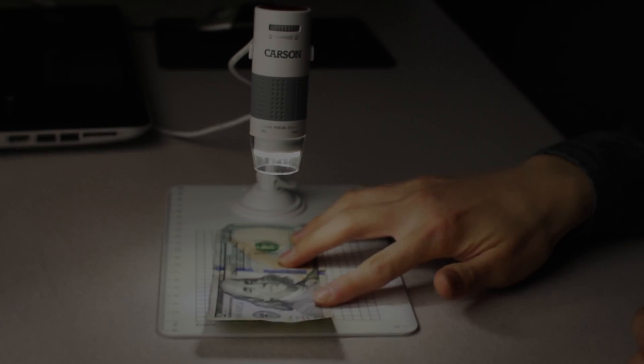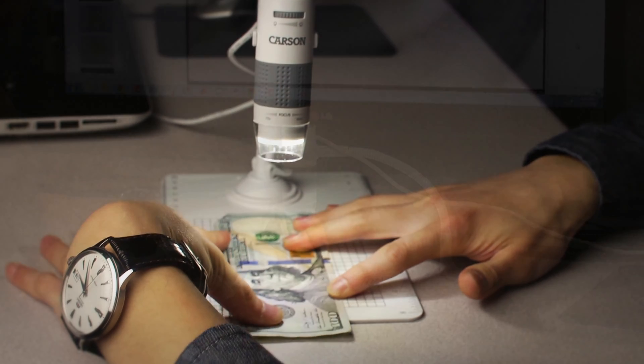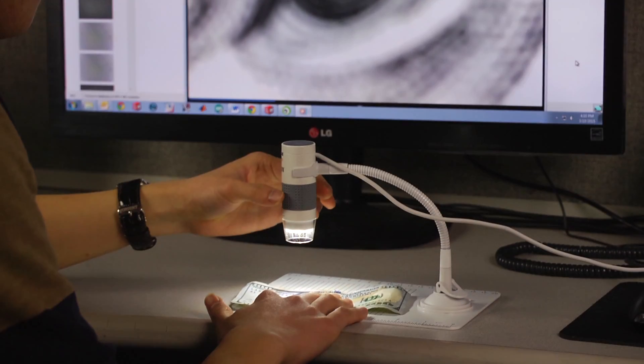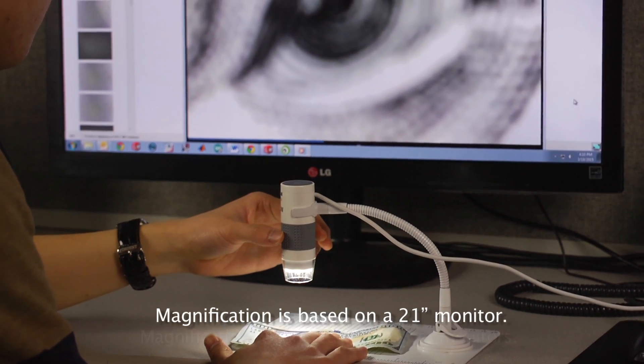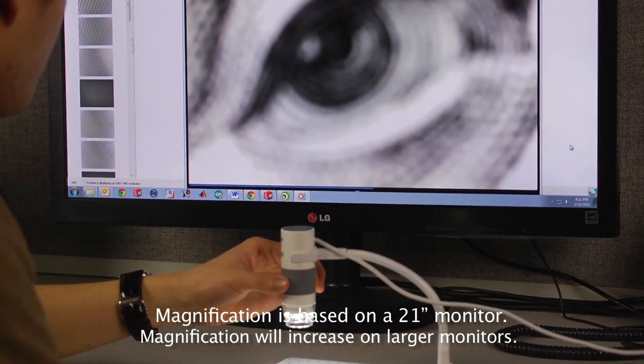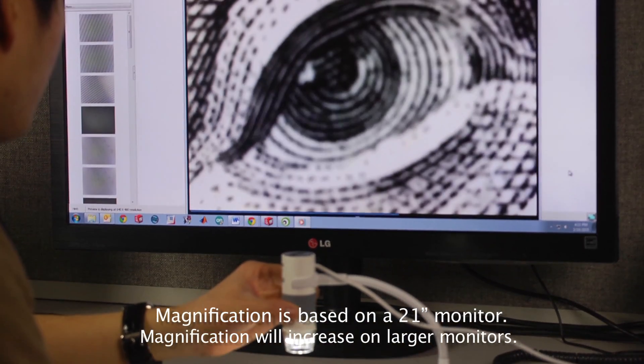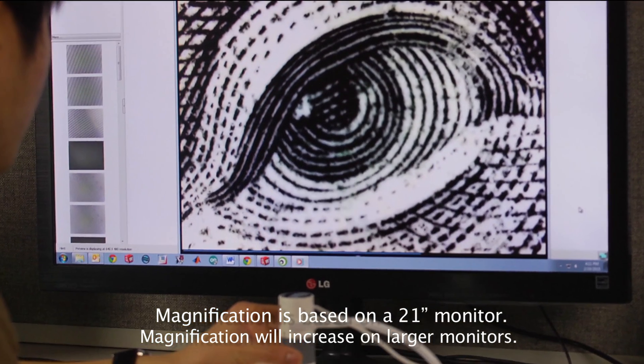The eFlex has a really impressive magnification range. You can choose between 75 and 300 power. Once you've chosen your positioning, rotate the focus wheel to bring out the sharpest image possible.